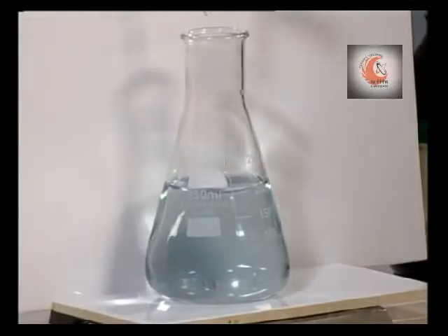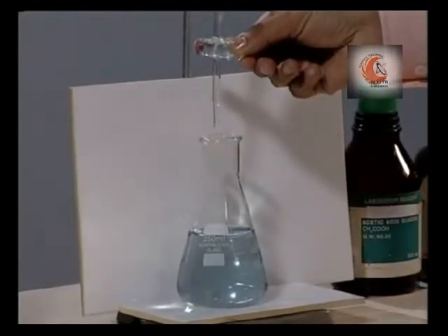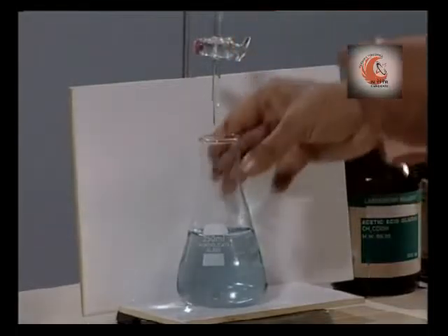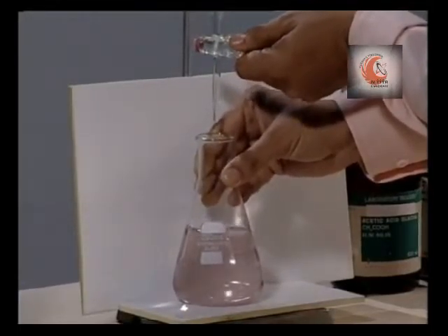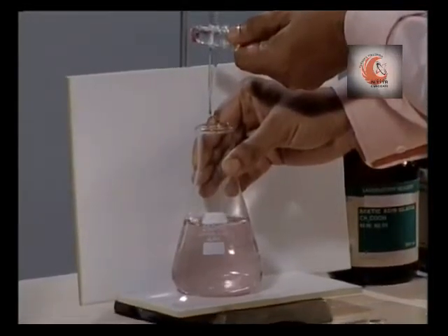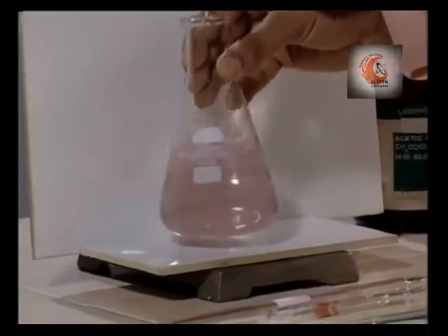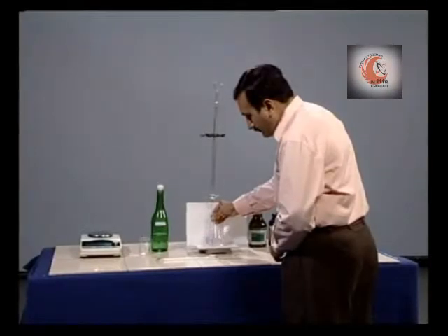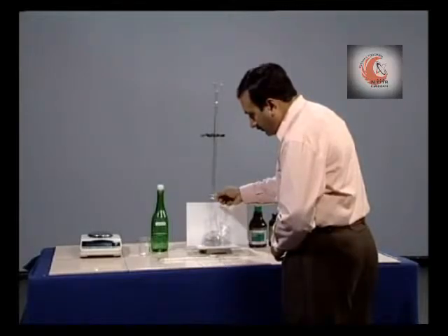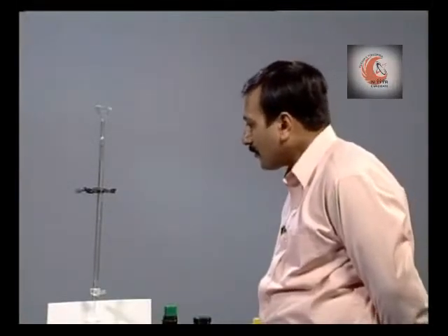Now, retitrate till the blue color disappears. Note down the final reading.